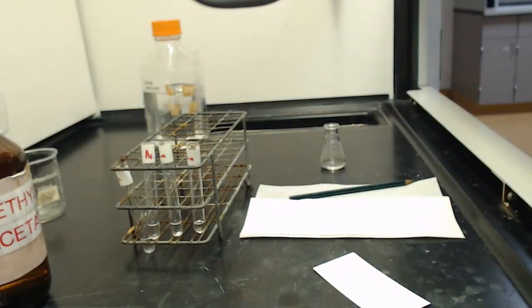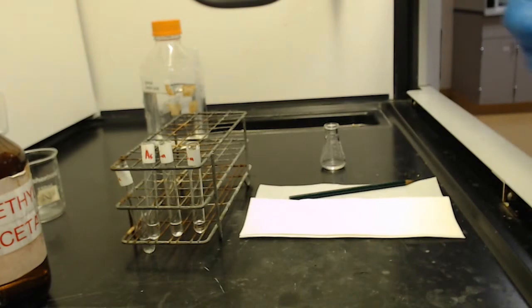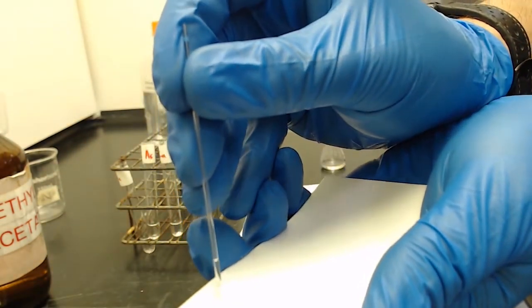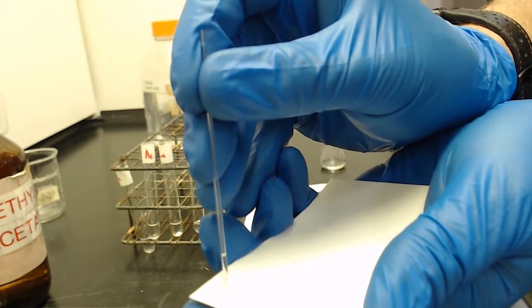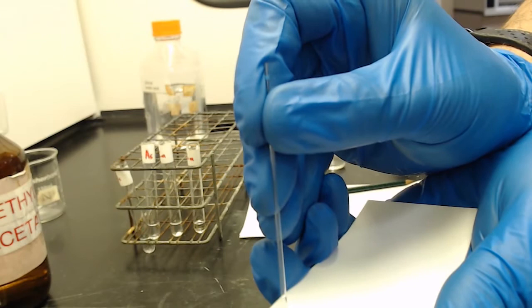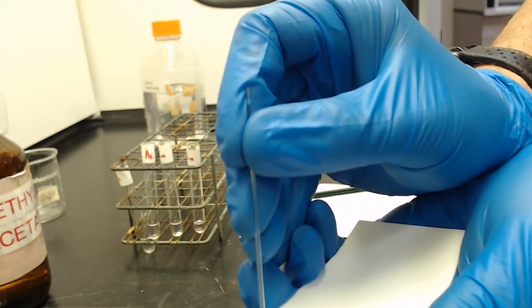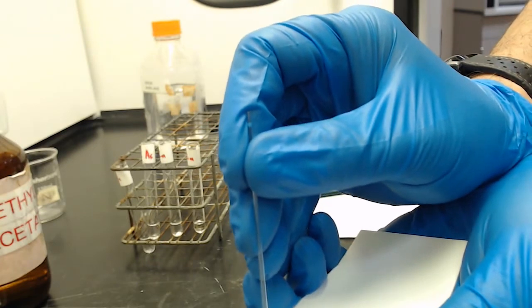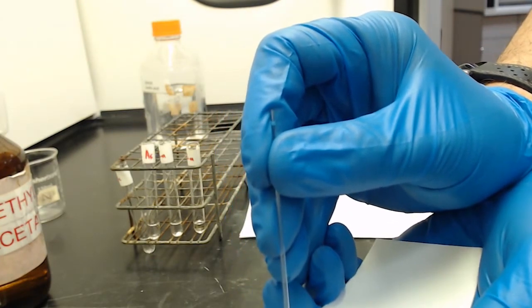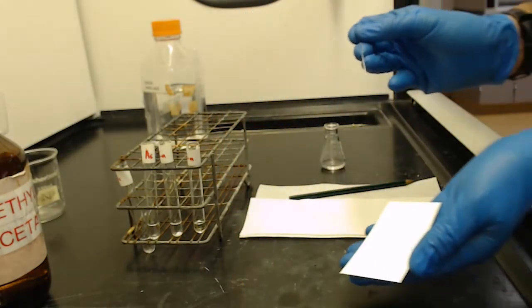And I'm going to try to do this so you guys can see it. This might be challenging. Typically you want it flat on the table, but I want you guys to be able to see it. So you just touch it on there. Just barely tap it on there to get a little teeny bit out at a time. You don't want it to spread too far. If your spot becomes too big, then you get poor separations. Okay. That should be enough for that sample.